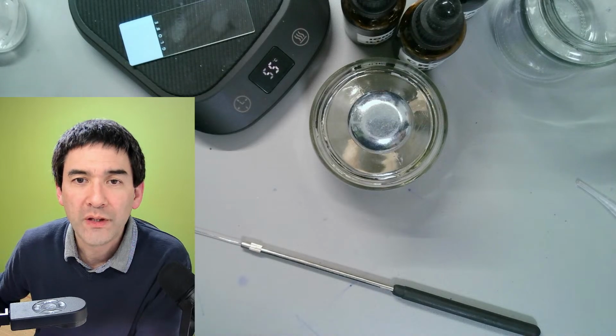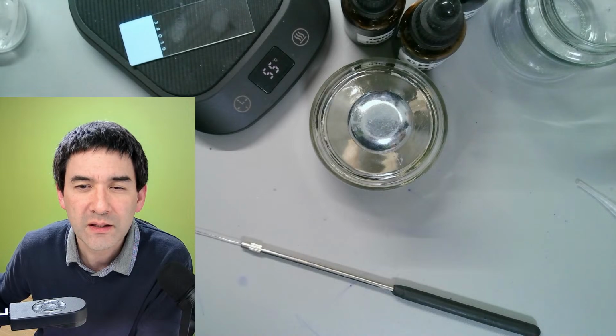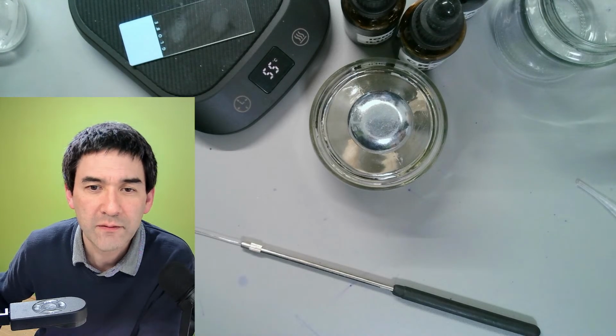So I'm going to read now about my first microscope. The reason that is the plan and semi-plan objectives. Okay, that's a comment here.